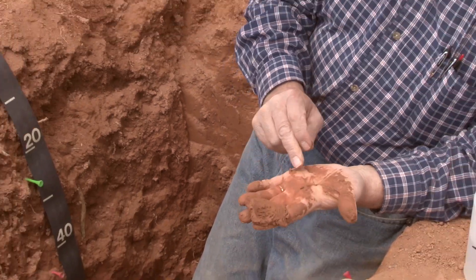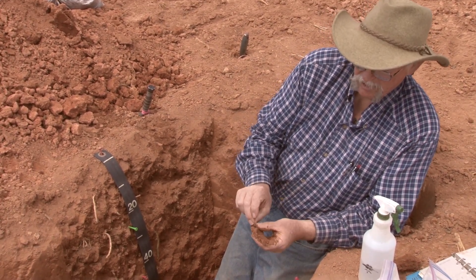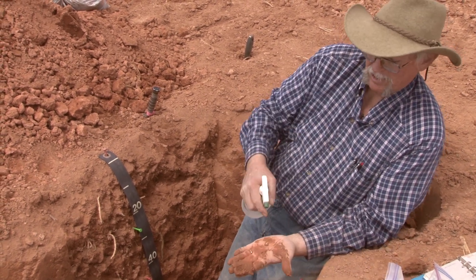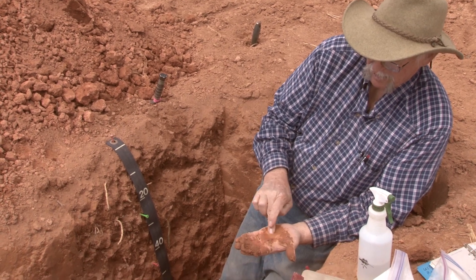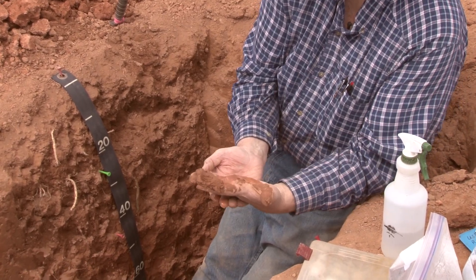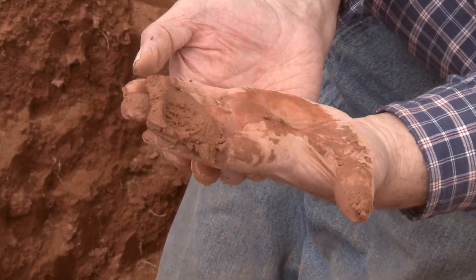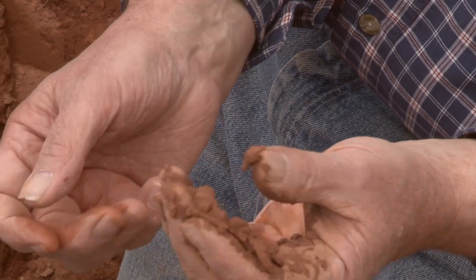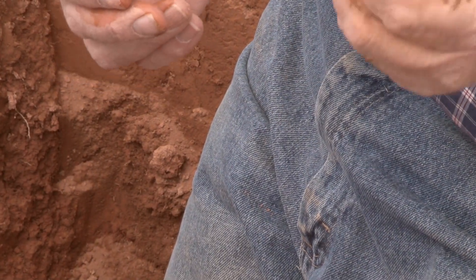To determine the amount of sand, take a small sample, put it in your hand, mix it up good, and look at what's left when you pour the water off. In this case, there's just a very, very little bit of very fine sand left in my hand. So that is the process you'd use on this silty soil.